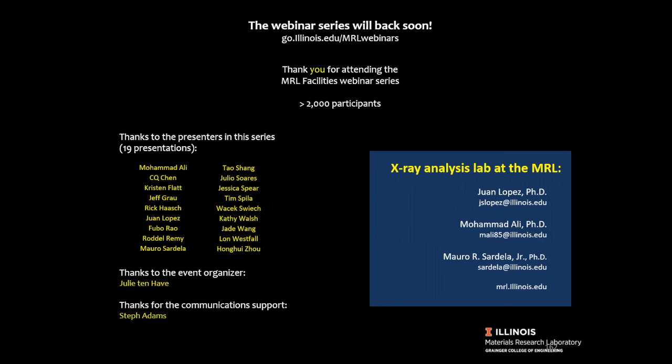Okay. When performing Rietveld refinement, how do you account for preferred orientation? I'm always worried about overfitting the data. Yes, that's a question we can discuss together. Juan is the master of Rietveld as well. There are features that you put in the software automatically. In the Jade software, there is a box that you click, and you refine the data and see if it makes sense. If not, you have to go back. Without seeing specific data, it's difficult to give a general recipe, but look for me or for Juan and we can talk to you about that.